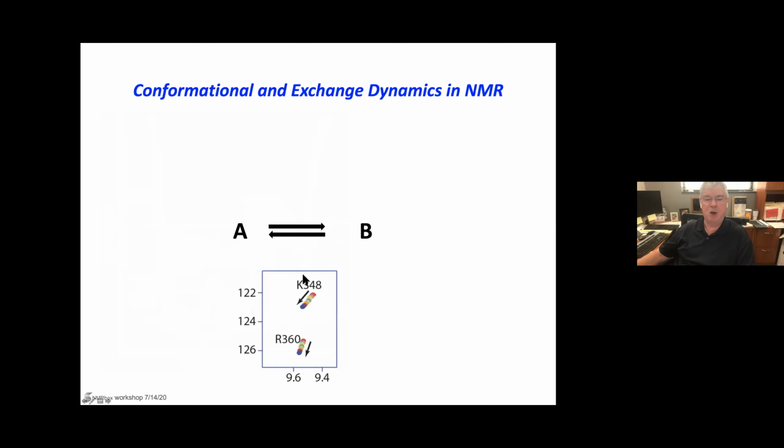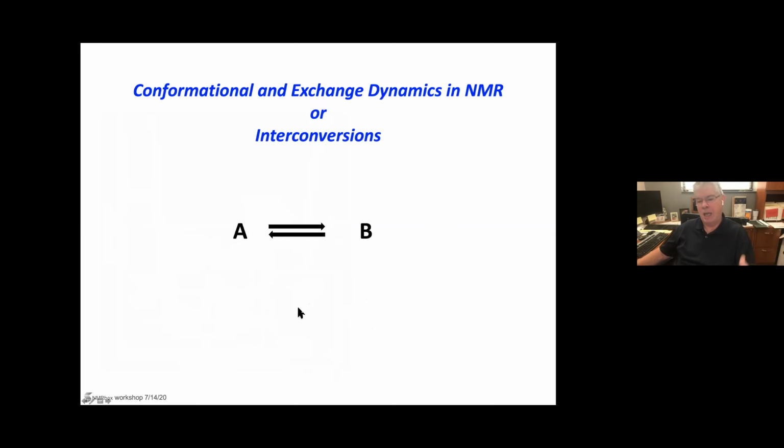We know from NMR that if it's in a fast exchange, you can titrate something and you can watch the progression. This is in an HSQC peak. It's a different molecular system, but you see the case so that you have fast exchange. You can see this, you can track this, you can plot it. There's cool software. Bruce talked about this a couple of weeks ago in his workshop, and with FX and the tools, so you can get out the KEX, et cetera, from that, and the KD.